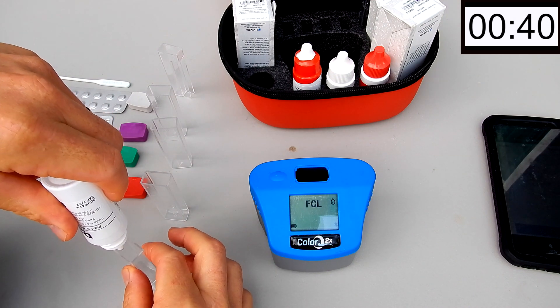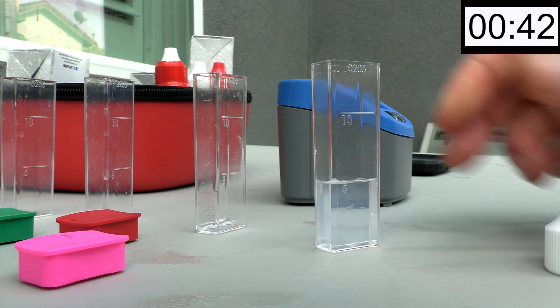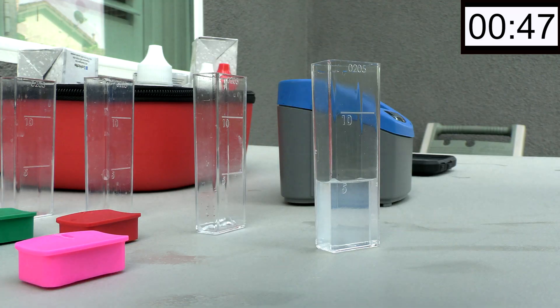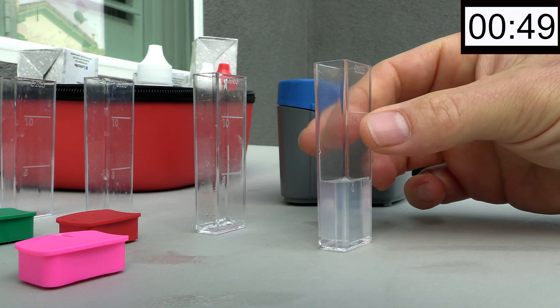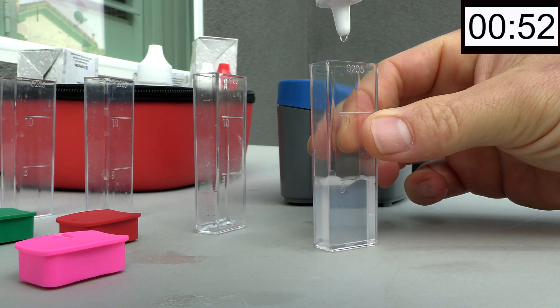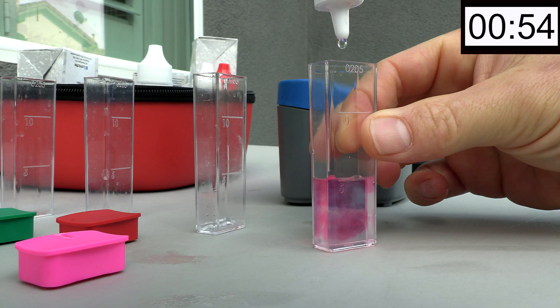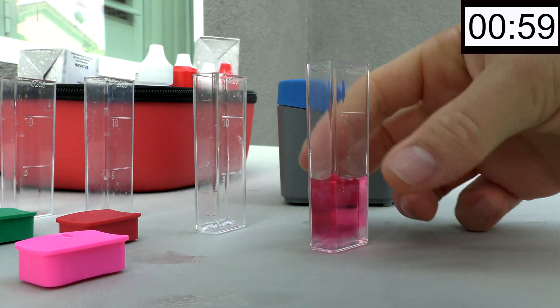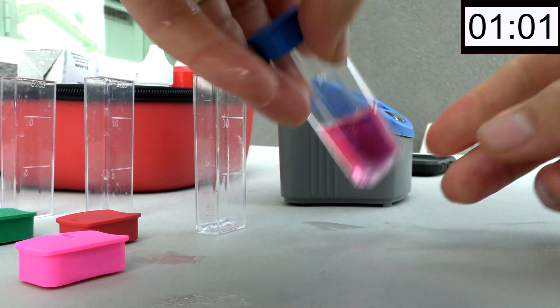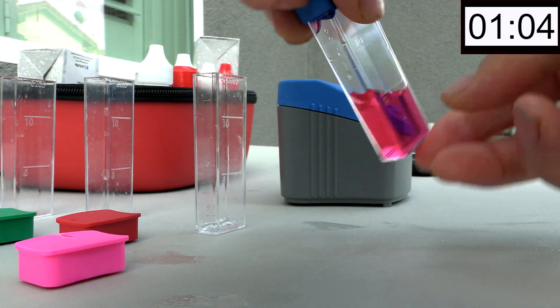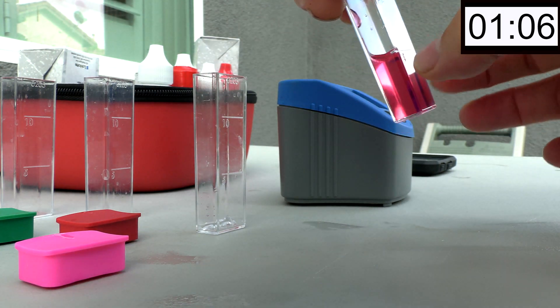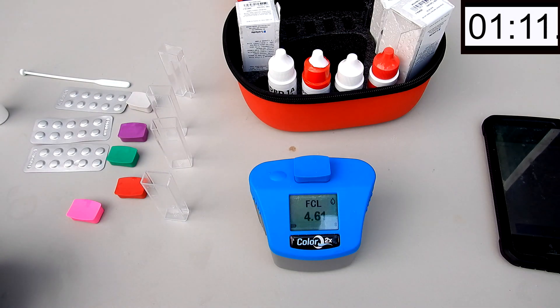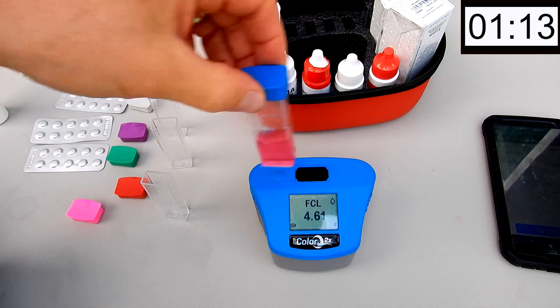I'll put 5 drops of the DPD-1, then 5 drops of the DPD-1B. Free Chlorine is 4.61.